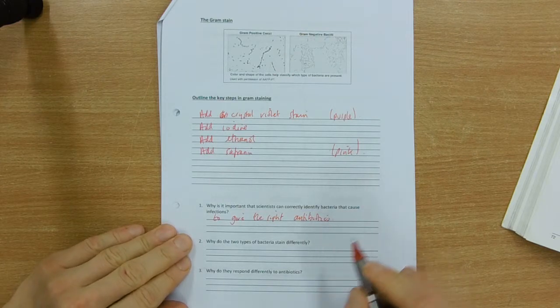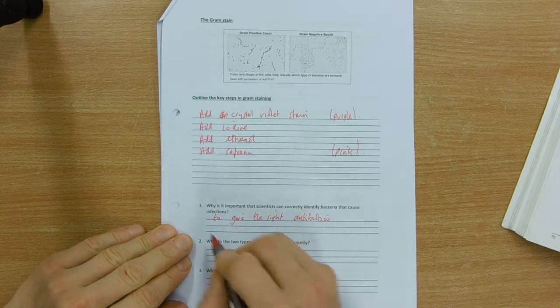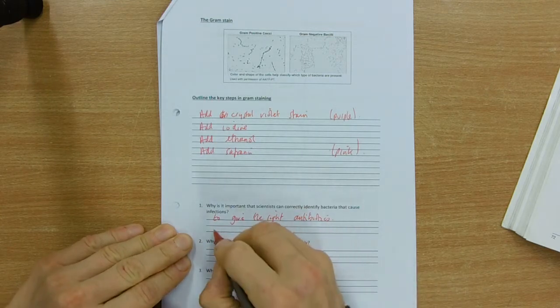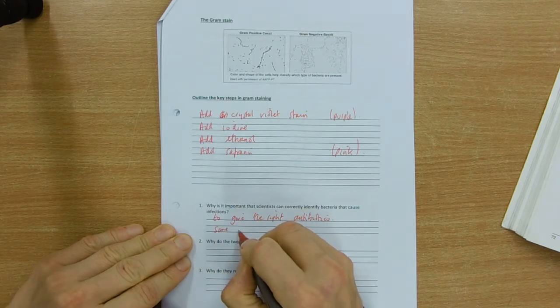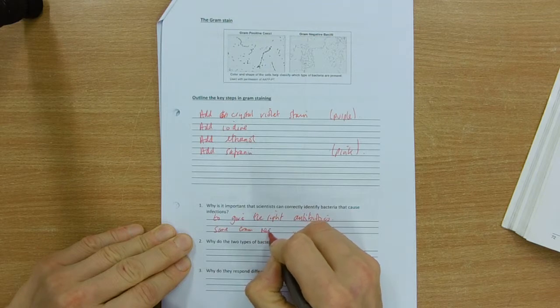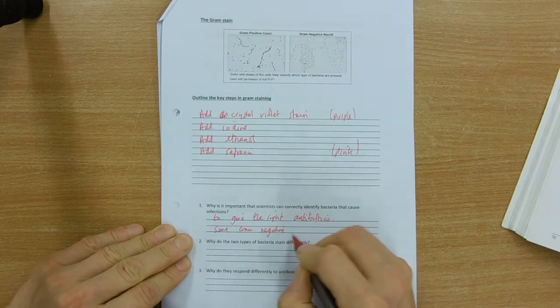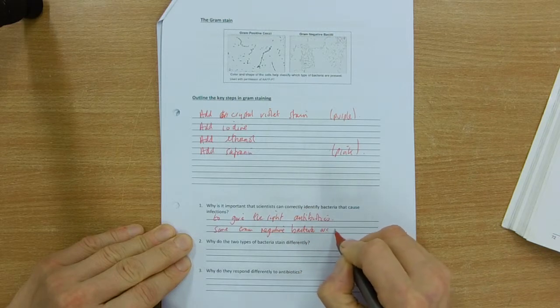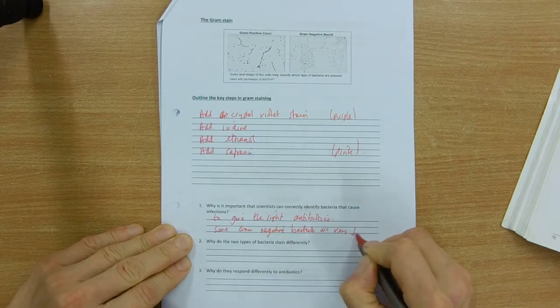And some, particularly gram-negative bacteria, are very dangerous. So some gram-negative bacteria are very serious.